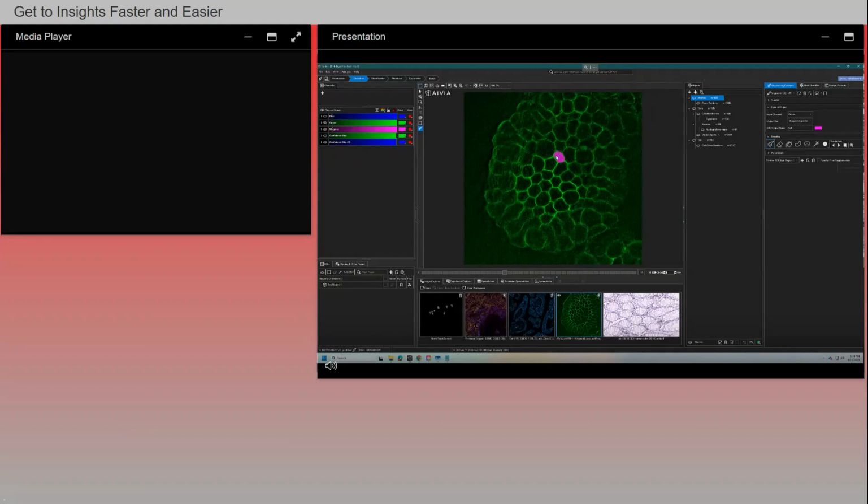1, 2, I'm going to get the smallest one I can find, maybe somewhere around here. And fairly large ones like this, and somewhere in the middle. Like this one. So notice I'm only painting on a single plane.